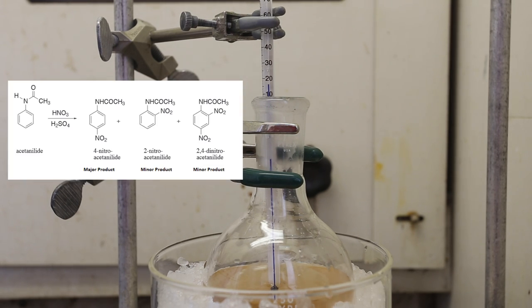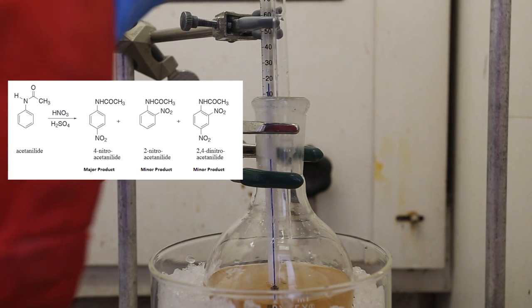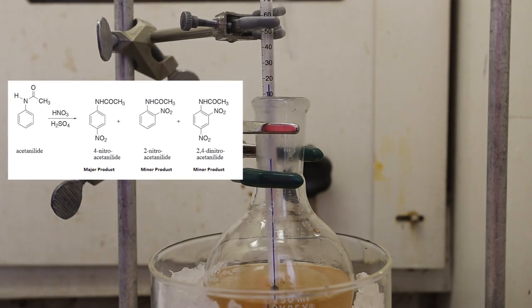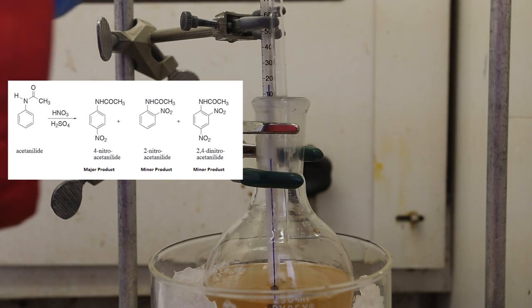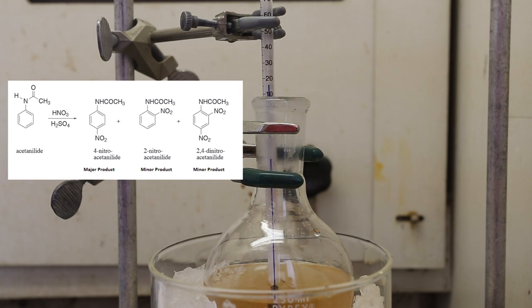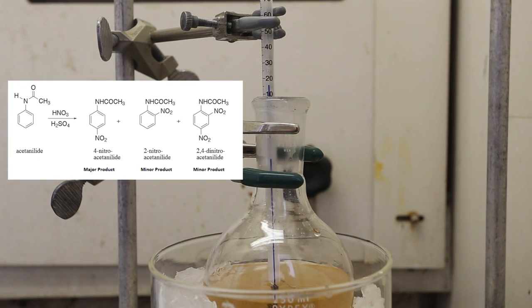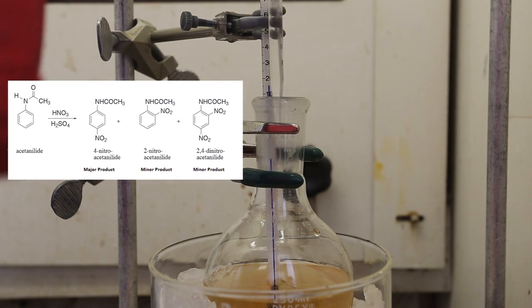Shown above is the nitration reaction that we are carrying out. On the left is acetanilide and on the right are the three products that can be formed. The major product, and the one that we want, is 4-nitroacetanilide or para-nitroacetanilide. The 2-nitroacetanilide, also known as ortho-nitroacetanilide, will also be formed, but it should be formed in much smaller proportions than compared to the para product.